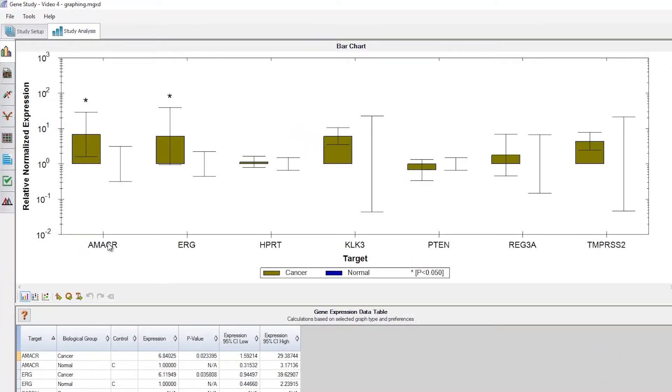Here, we're looking at the expression results of multiple samples of both cancerous cells and normal cells. These samples have been grouped into two biological groups, cancer and normal.